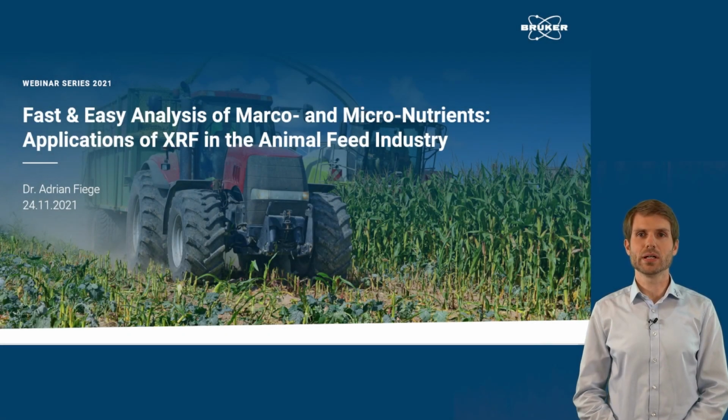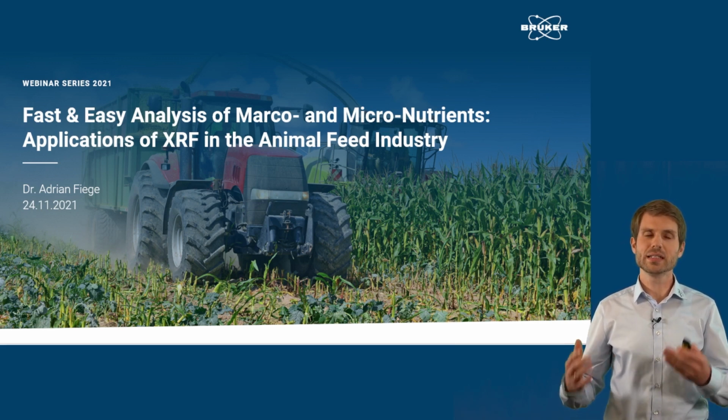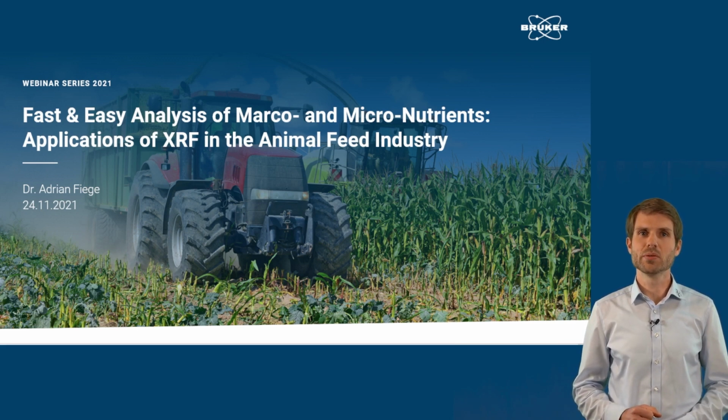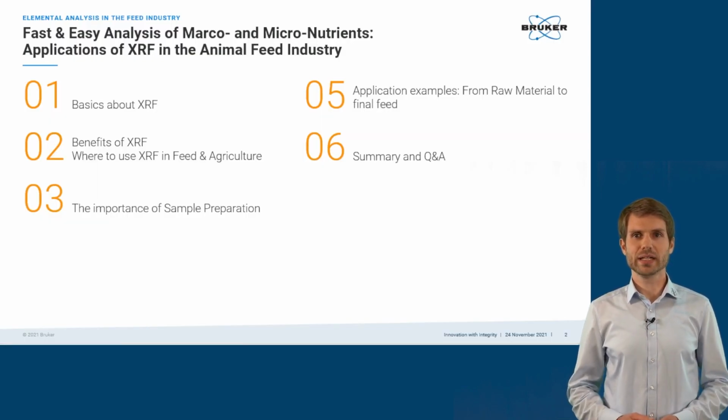Today we will talk about XRF analysis in the feed and agricultural industry. Moreover, we will focus on the fast and easy analysis of macro and micro mineral nutrients in feed supplements and similar materials. Here's a little bit of an outline of today's presentation.